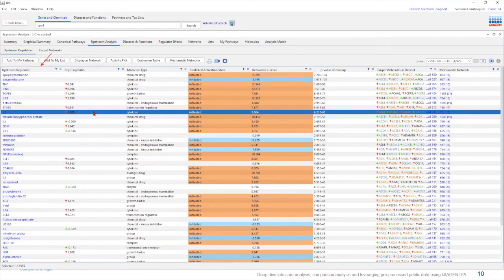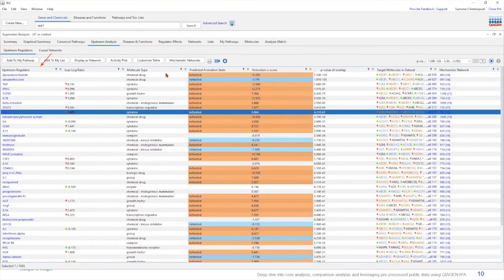The upstream regulators in the pathway can be a transcription factor, micro RNAs, drugs, chemicals and much more. And the upstream regulators that are most significant by the p-value of overlap are shown at the top of this table.